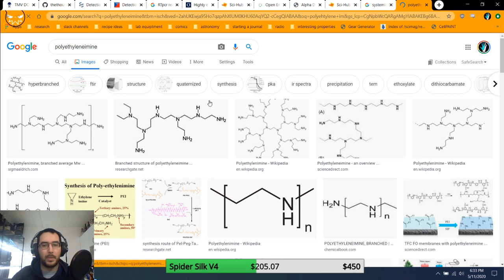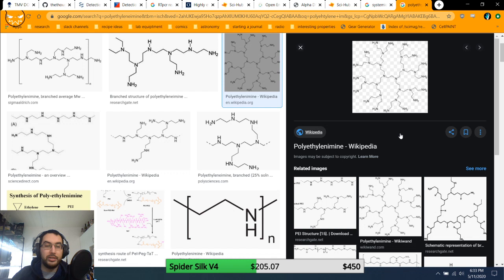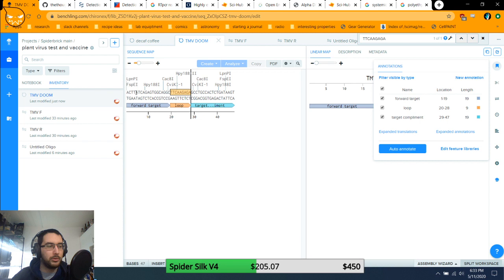So this is actually what's called a dendrimer, which are fascinating compounds. It's really just this same simple short compound, this N-carbon-carbon-N, that you can grow into really crazy structures. There are linear versions and weird branching versions, but I think this is the one I have. Basically, it forms a complex with the thing you want to deliver, be it RNA or DNA, and it makes it much easier to get into the plant. So the idea is that I'm going to mix this with the RNA that we've just found, and I should be able to just spray it on the plant or inject it into the plant, and that should do the job.